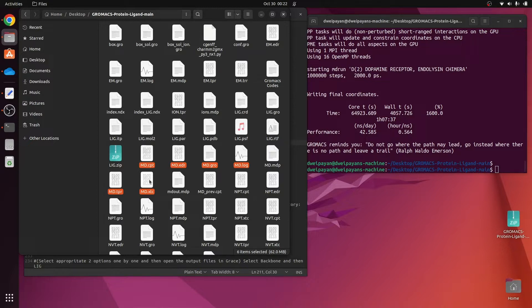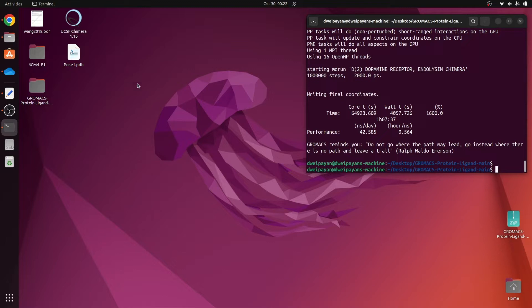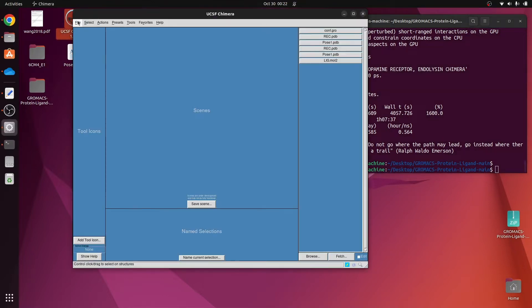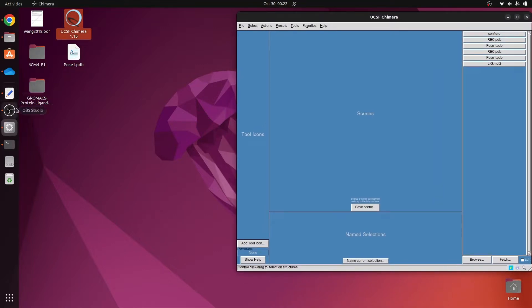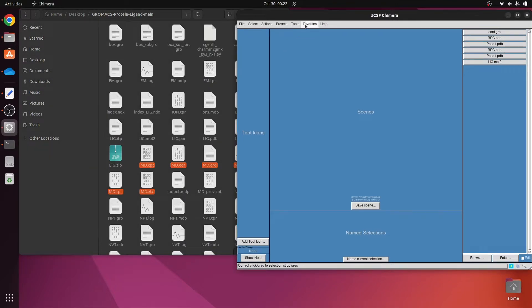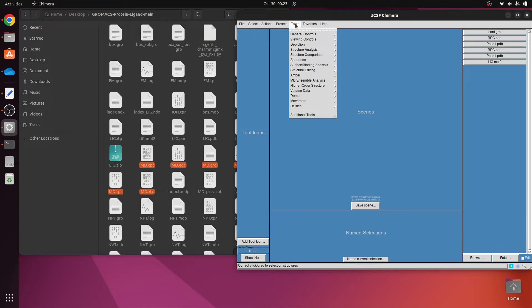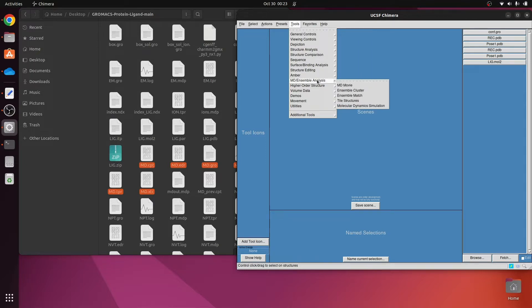For that, we will make use of the program UCSF Chimera. I'll open UCSF Chimera and keep the working directory folder open so we can see the output files. Once UCSF Chimera is open, go to Tools on the menu bar, hover over the option that says MD Ensemble Analysis, and then go to MD Movie and click on it.